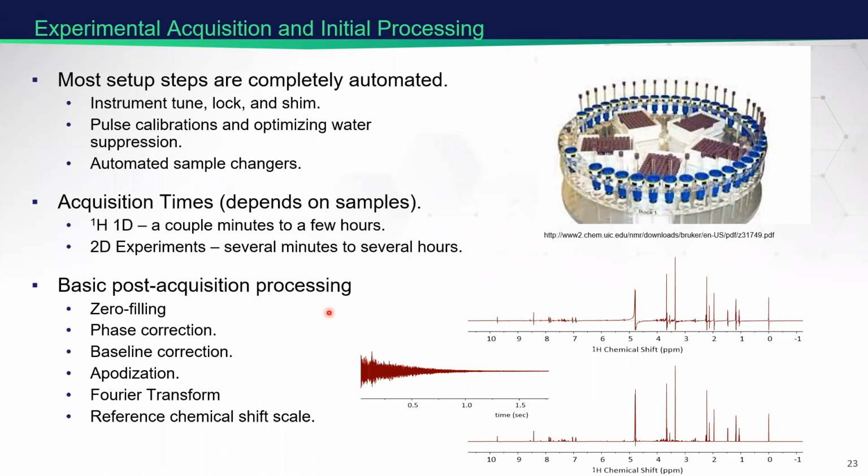So once the signal is acquired, we need to do some things to convert it into a form that is more interpretable by us. And so I've listed some steps that we do that. I think some of these steps will be highlighted in more detail later today during the data analysis or data processing talk.